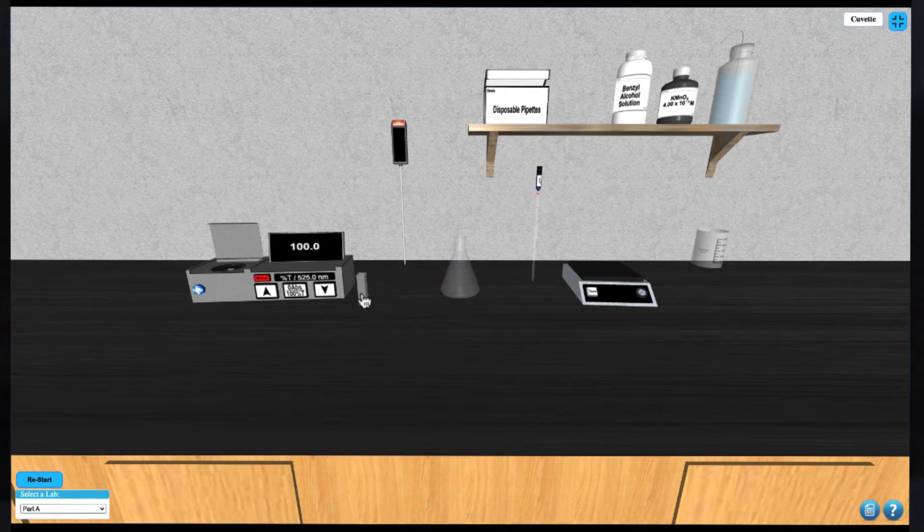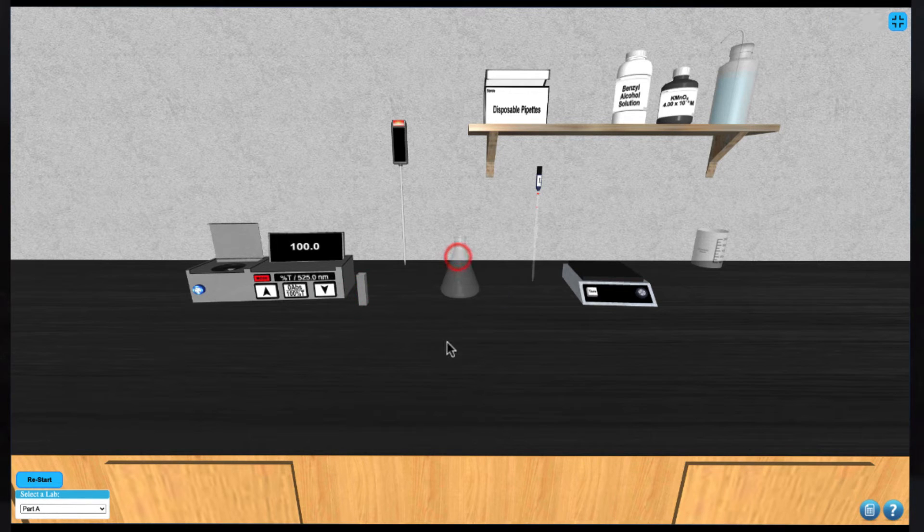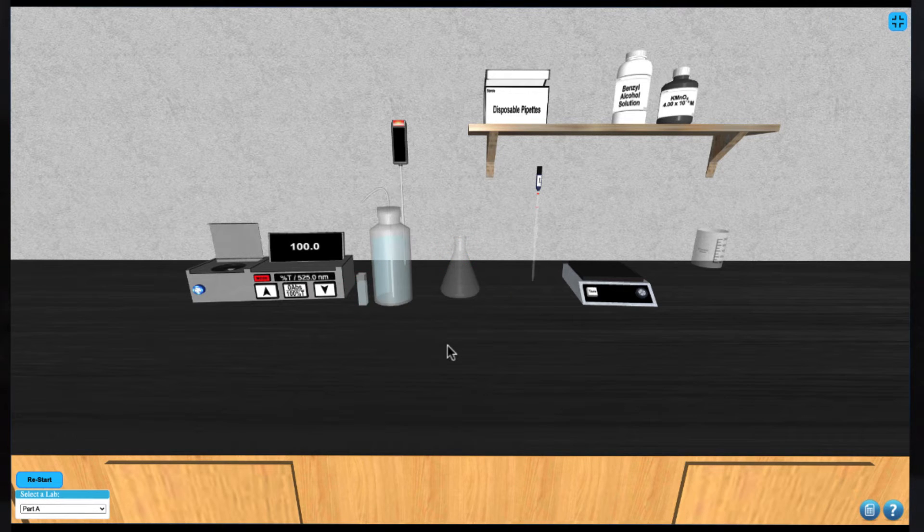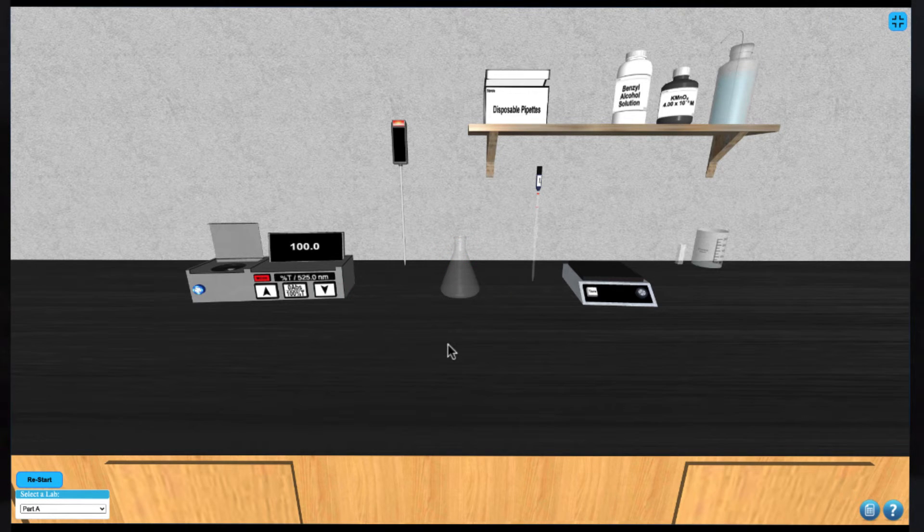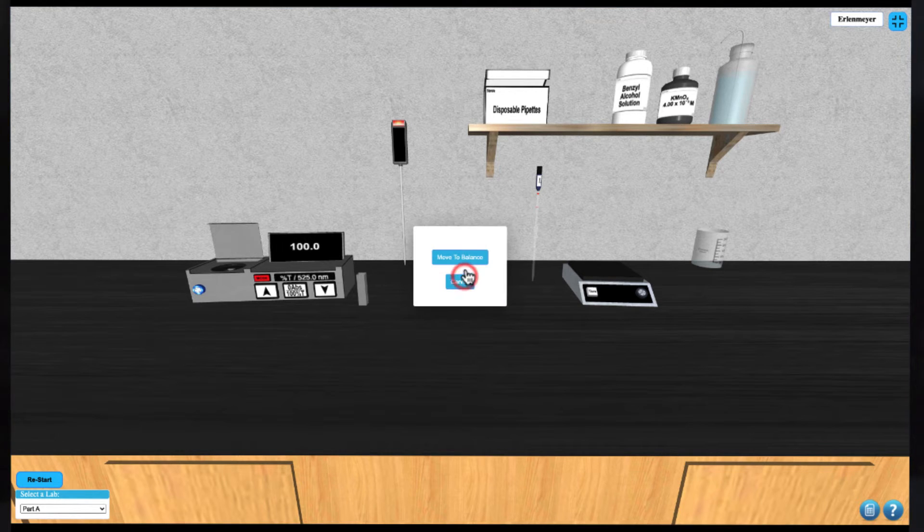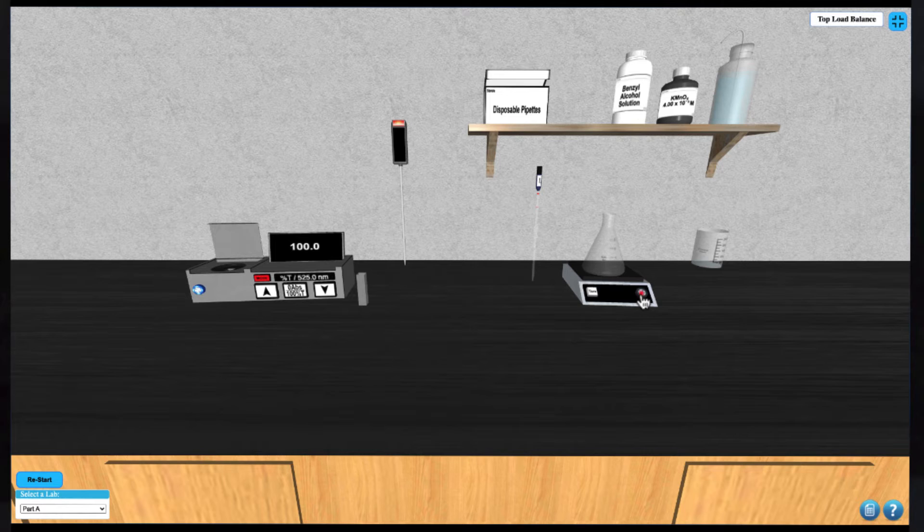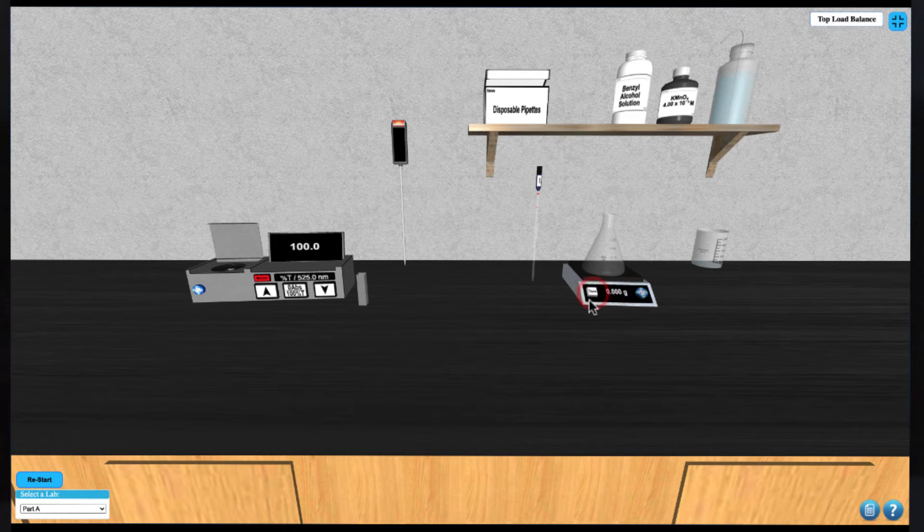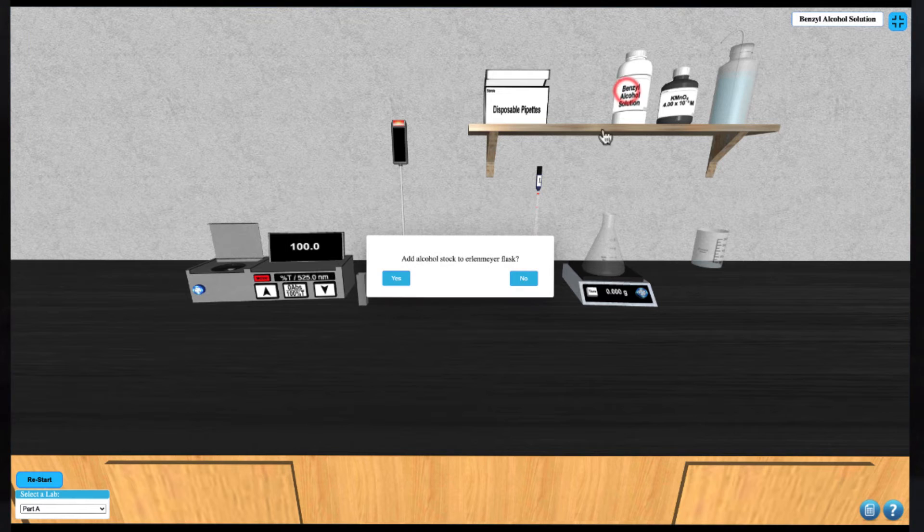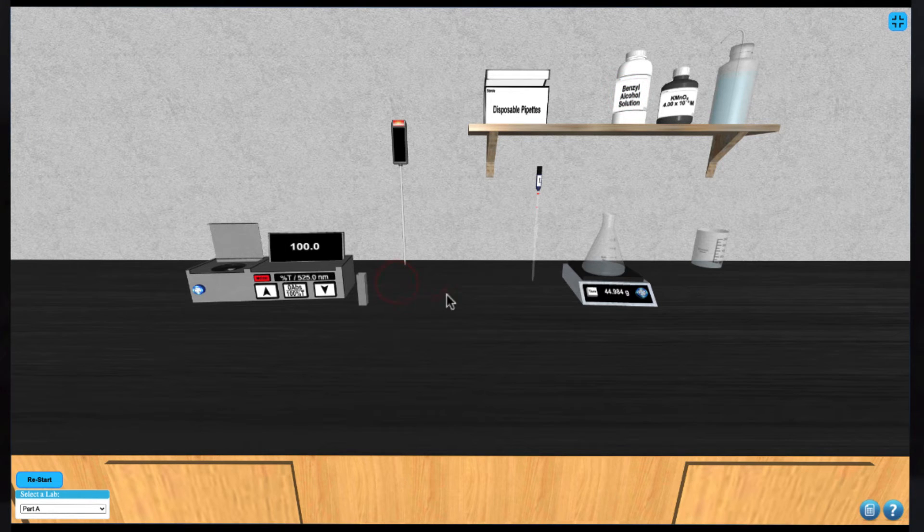Next click on the cuvette to clear it and then click it again to rinse it. Now you can turn on the balance and click on the Erlenmeyer flask to move it to the balance. Click on the bottle of alcohol stock solution to add it to the Erlenmeyer flask.